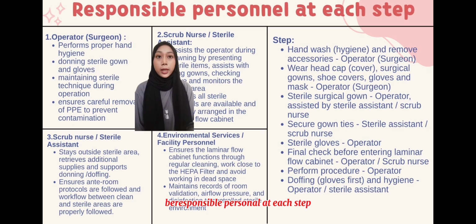Responsible personnel at each step. First is the operator or surgeon. Perform hand hygiene and remove accessories. Second is wear head cap, sterile gown, shoe cover, gloves and mask. Third is maintain sterile technique during the operation. And lastly is remove PPE carefully to avoid contamination.